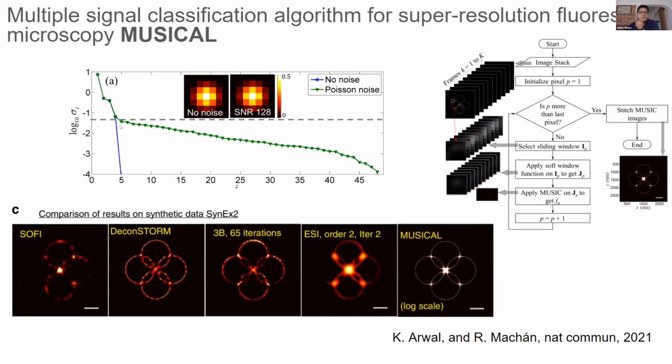And the criterion is established by the inflection point. This is the inflection point on the singular values of the eigenvalues. And when it starts to bend, that sets a threshold for your imaging. As I said, part of these methods are based on signal to noise ratio classification, but it's not an arbitrary thresholding. It's well-defined and well-computed in this example. So it's quite powerful in that sense. Another interesting thing about this method is that the computation of the eigenvalues, the interpolation, and the denoising are all carried out at once because it's linear algebra.